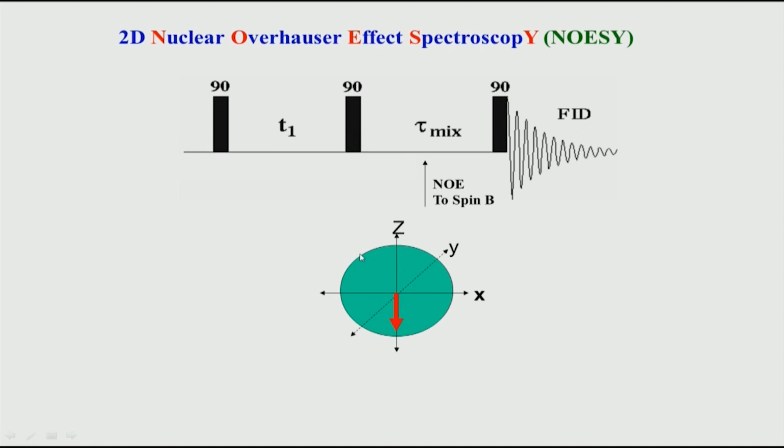So, how does the NOESY experiment work? This is the pulse sequence. This is how we record. Remember what I spoke about in the last 2 slides, we talked about irradiation. That is called a steady state NOE, meaning I am irradiating a signal, waiting for it to reach a steady state saturation, and then I am recording and seeing the effect on the neighboring hydrogen.